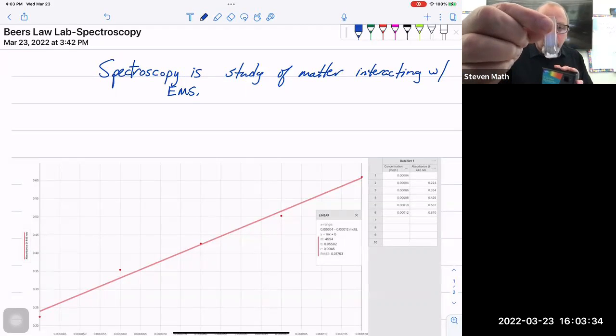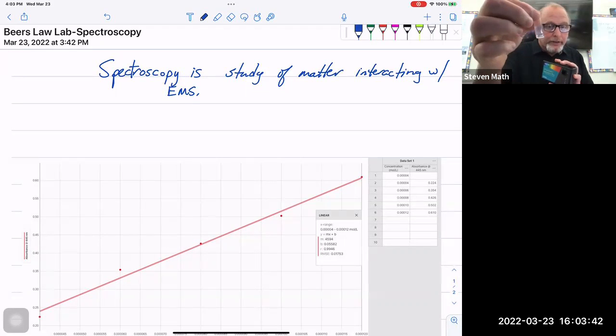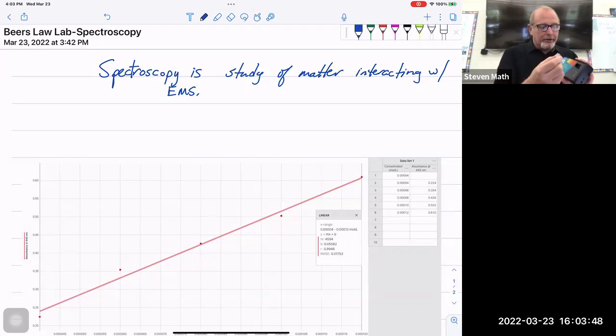You can see that on one side of the cuvette there are ridges, and on the other side of the cuvette it is clear. If you notice, I'm holding it on the side with the ridges. I take my cuvette and turn it so that the clear sides are in alignment in this direction.